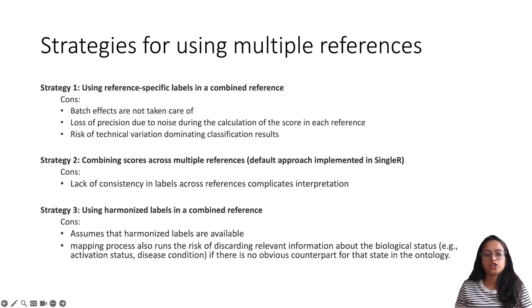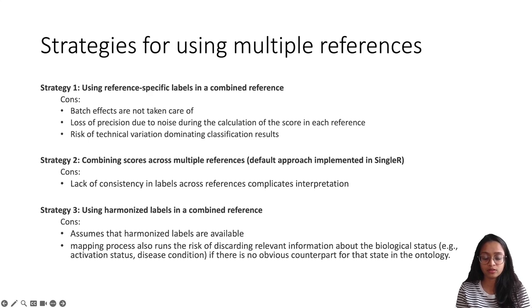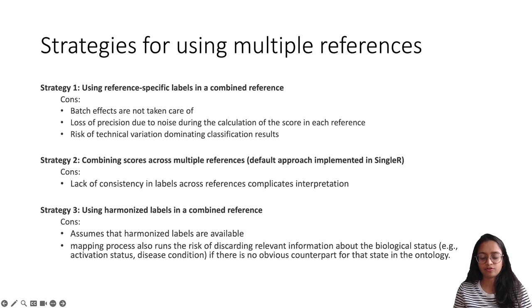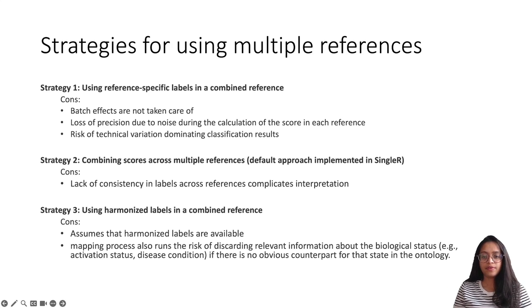The authors of the SingleR package recommend three strategies one can use to perform cell type annotation using multiple references. The first strategy involves using reference-specific labels in a combined reference. When we say combined reference, we don't mean references where the labels are harmonized — we just mean combining both the separate references, combining the expression matrix and labeling each label in context of its reference dataset. For example, if we have reference X and reference Y and both have B cells, the B cells from reference X will be considered a separate entity compared to B cells in reference Y.